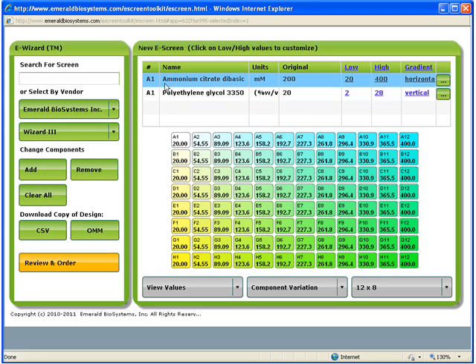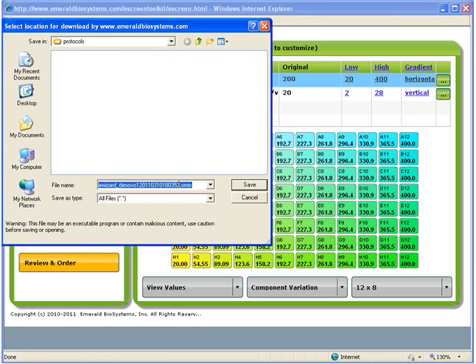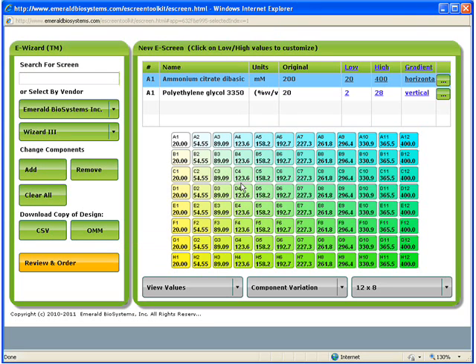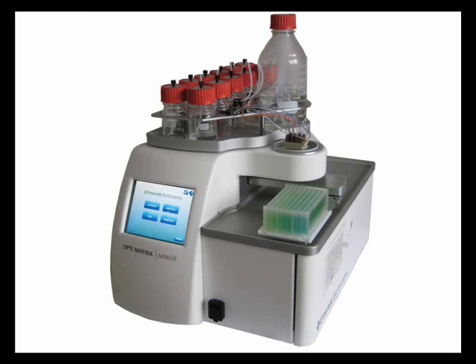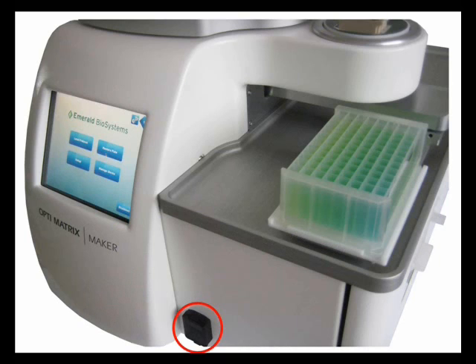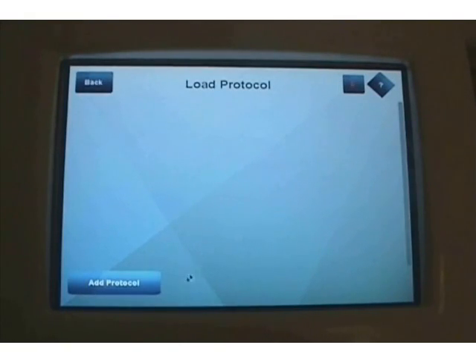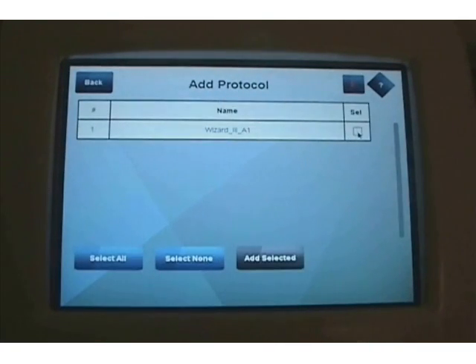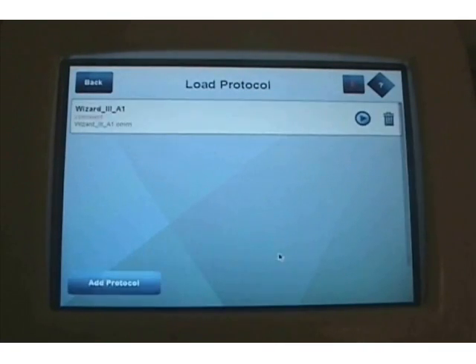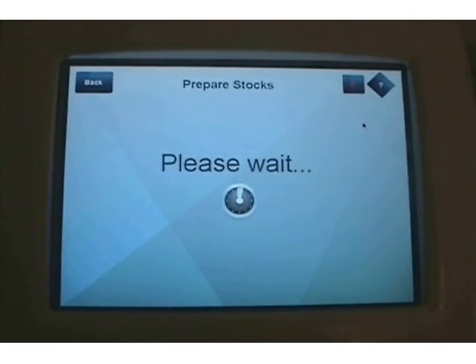Now that I'm happy with my design, I simply click the OptiMatrixMaker button, give the file a good name, save it to a portable USB drive in a folder called Protocols, and it's time to head to the instrument. Now that I have designed my screen, I need to load it onto the instrument to begin production. I'll plug in the USB drive into the port on the front of the instrument, load the screen by going to Load Protocol, Add Protocol, and selecting the desired file. My Wizard3 Condition 1 file is now loaded on the machine, so I click the Play button to start.